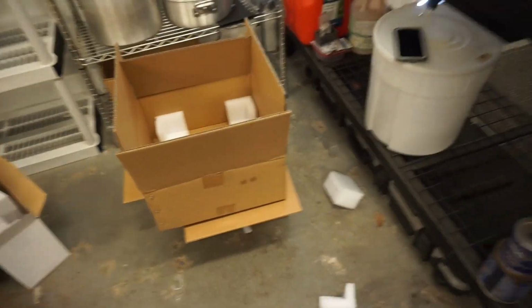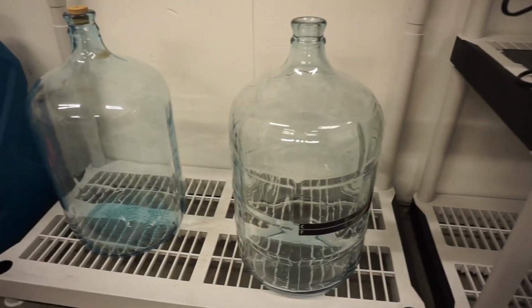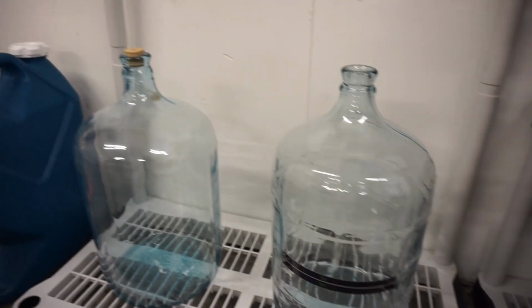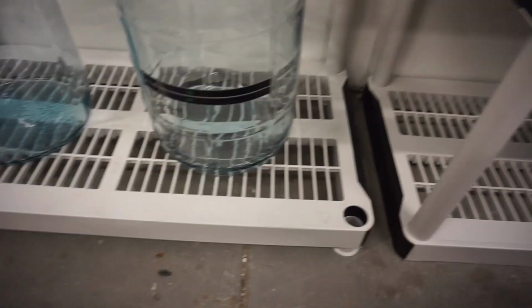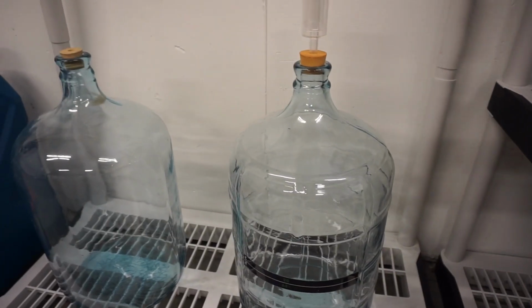And then the other things that I got are these 2 big boy carboys, 5 gallons, glass. They're in great shape. Gonna have to sterilize them and clean them out. Like I said, I got them from a guy that brewed beer, didn't anymore. So, very exciting stuff. Very exciting.